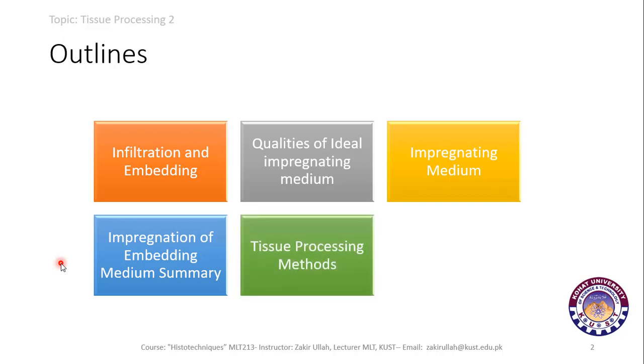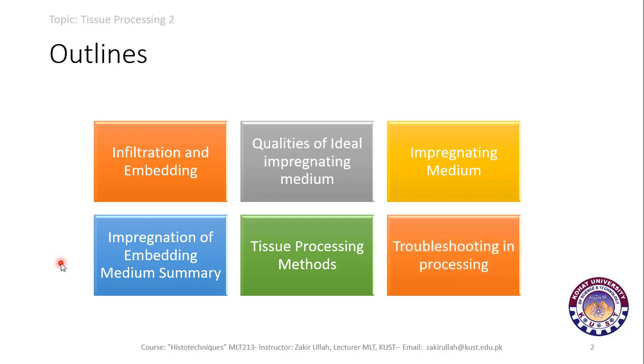We will also discuss the manual and automated types of tissue processing and their machines, and in the last we will discuss troubleshooting in tissue processing.